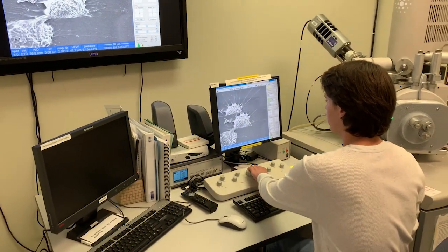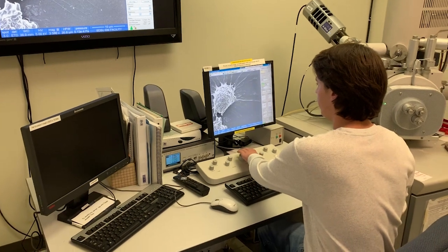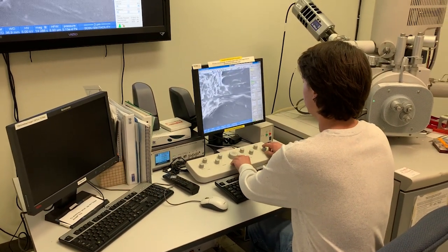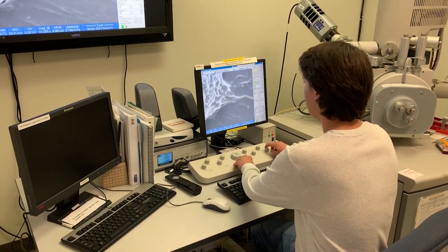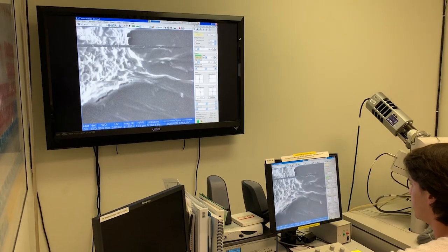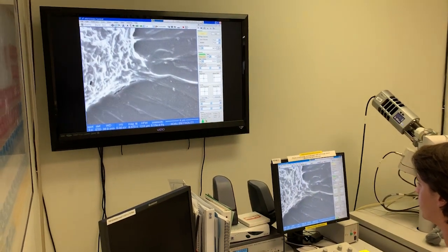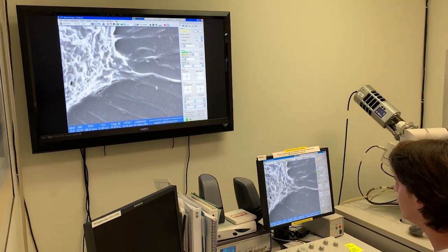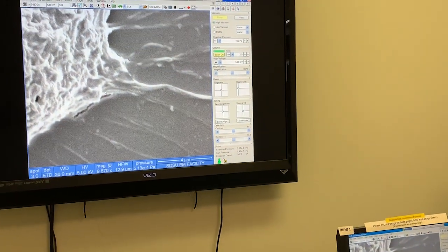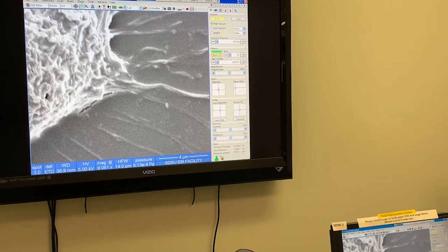Over on the edges here, we have the filopodia. You can start to look a little more at them. And again, as Ingrid mentioned before, we're looking at purely surface features. One of the things that gives us contrast is something called the edge effect. With sharp edges, you're going to have a brighter area. This is what we'll be able to distinguish in this picture.